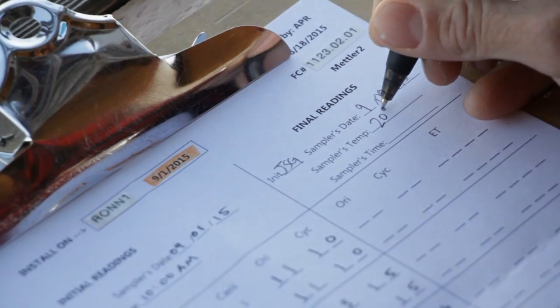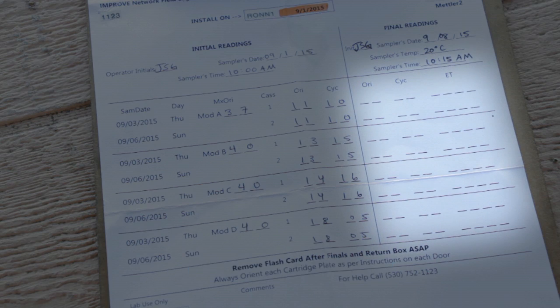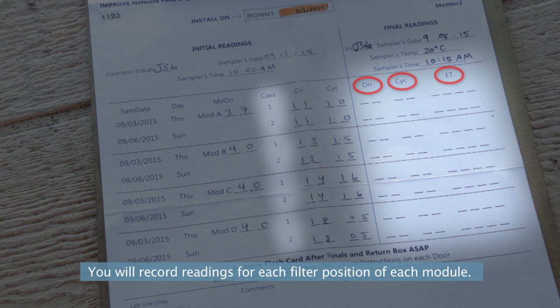sheet. Now you can do your final readings: ORI, CYC, and ETs. ORI stands for orifice, CYC stands for cyclone, and ET stands for elapsed time. You will record readings for each filter position of each module.